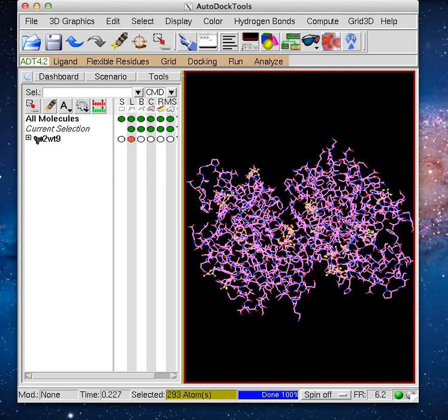If you're curious about how many residues these are in, you can change the selection level in AutoDock Tools from atoms to residues and see that these 293 atoms belong to 16 different residues. So this file will need some more processing before it can be used with AutoDock.